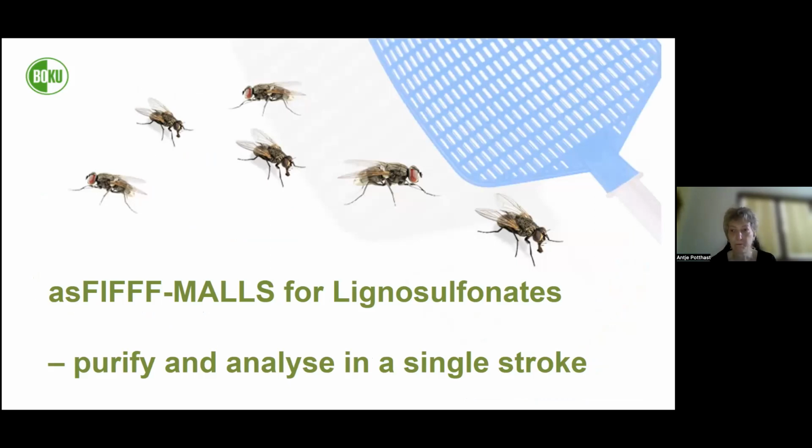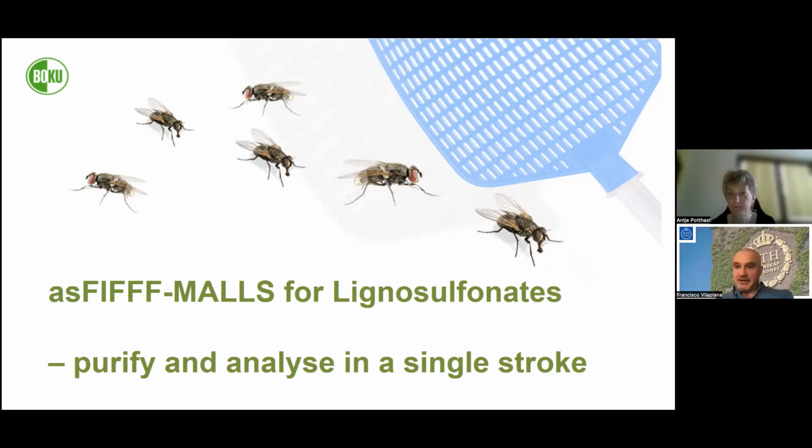I have actually one. I'm curious. You were talking about the dN/dc. Which, yeah, we all know is super important. But I'm thinking now, imagine you have a lignin which has different chemical structure based on size. And then you get the distribution, and then of course the dN/dc might change from slice to slice of elution volume. Is there any way to solve that problem? It's the same with polysaccharides.